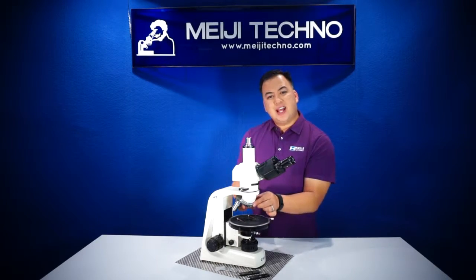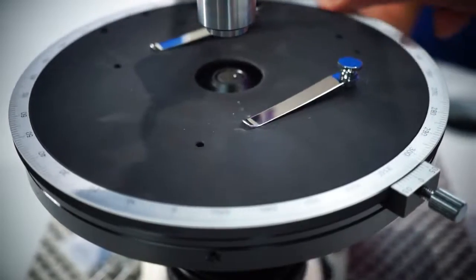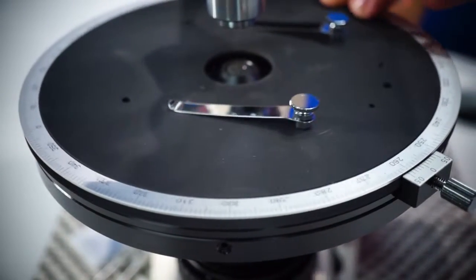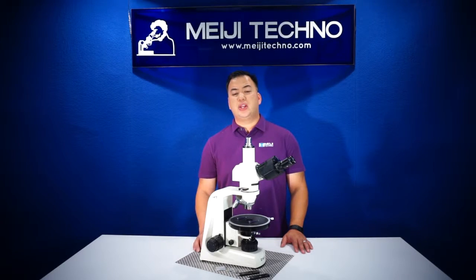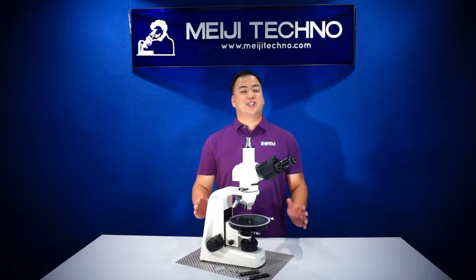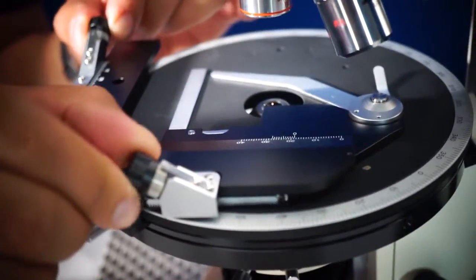The MT-9000 also comes with a ceramic coated 175 millimeter diameter ball bearing rotating graduated stage that rotates 360 degrees with one degree increments and vernier readings to 0.1 degree, along with two stage clips. An optional attached mechanical or point-counting stage is also available.